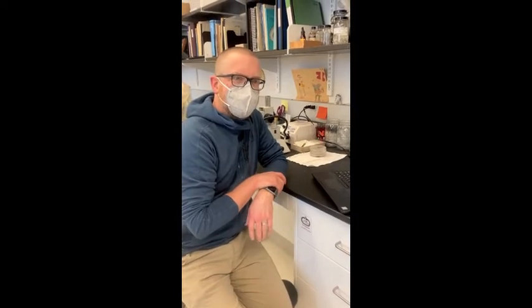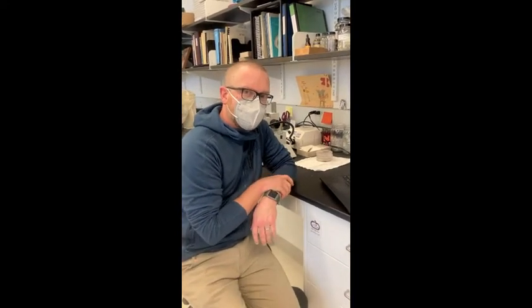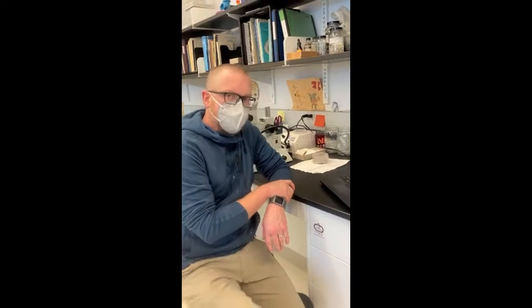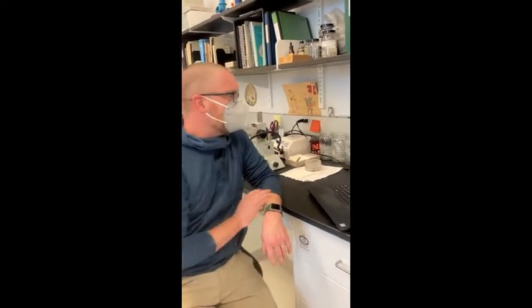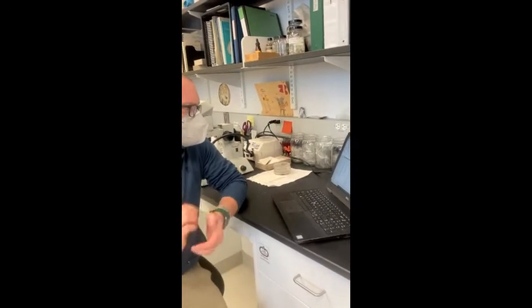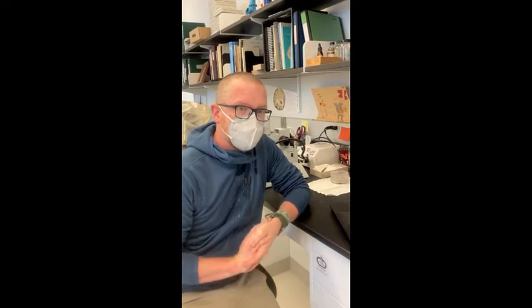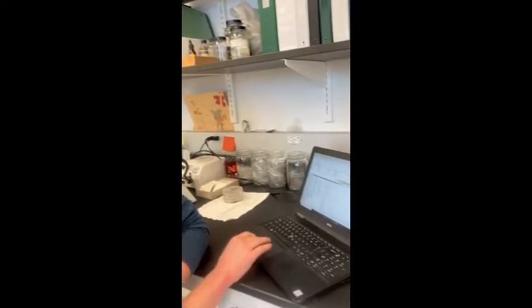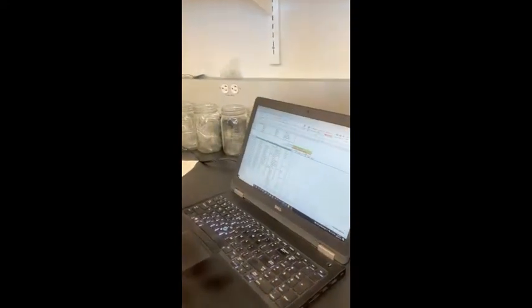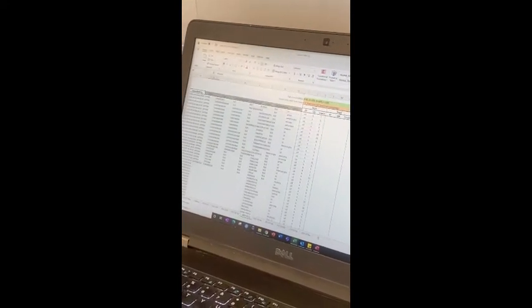Hi, I'm Aaron Moore. I'm an environmental scientist down here at the Agriculture and Environmental Lab, working with the biomonitoring program. In the last video, Jim was talking about entering some of our bug data into his computer after he identifies them on the microscope. After we identify the bugs, all the different taxonomists put them all together into an Excel spreadsheet where they are all accumulated in the same place.